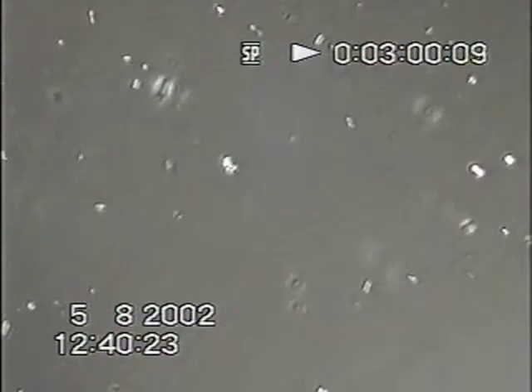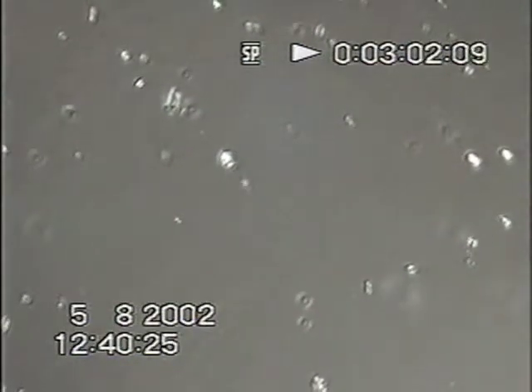There's a very active one. Ooh, it's fairly going. Here he comes again. Wiggle, wiggle. Yeah. Where's he going? Oh, he's in an awful hurry. Wow!